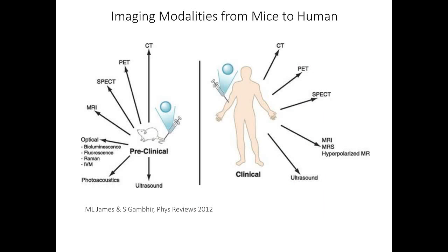While there are multiple types of imaging modalities available, it doesn't necessarily mean that they are available in the preclinical setting in small animals, large animals, and also available in humans. There are some caveats to how they can be translatable. So I'd like to present this slide just to give an overview of what imaging modalities can easily translate to the clinic or are already available in the clinic.